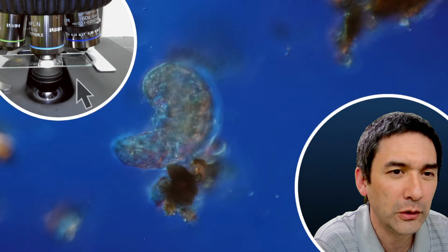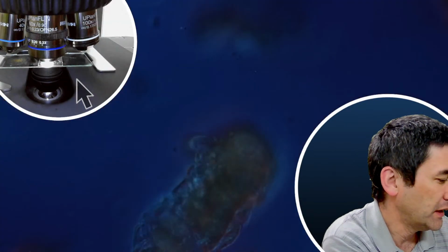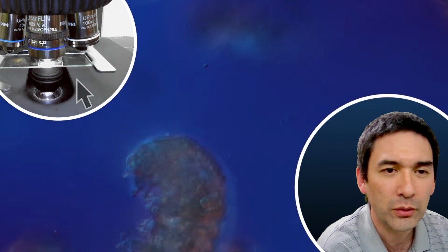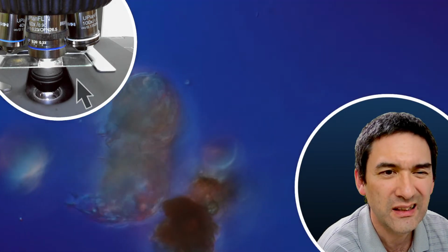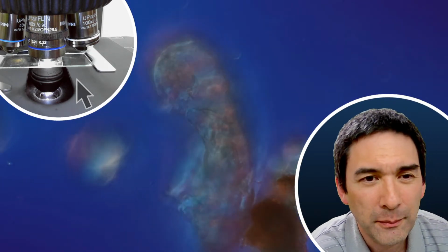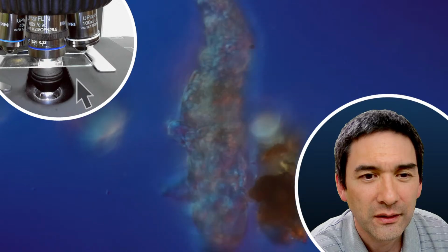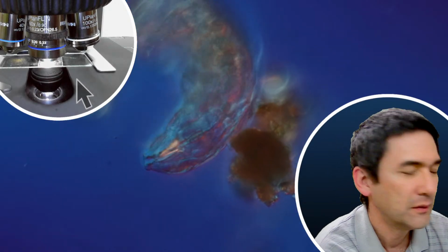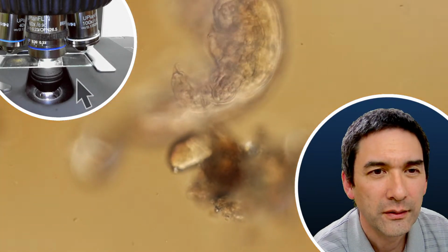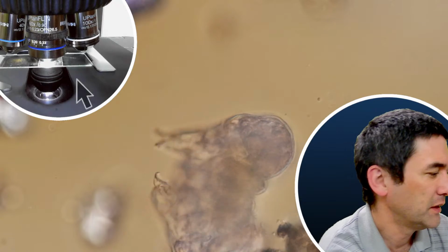And I'm going to now try the following. I'm going to go up yet higher. 600 times. I have to adjust the condenser as well. Go up with the light intensity, open it a little bit to give it a little more light. That's now 600 times. You see that not so good. Maybe you see that it's already a little bit, yeah. The depth of field is quite low. Still too much water, still too thick. Let's try like this. Give it a little more light. Yeah, you see, large magnification is not always the best. So let's go down to 400 again.